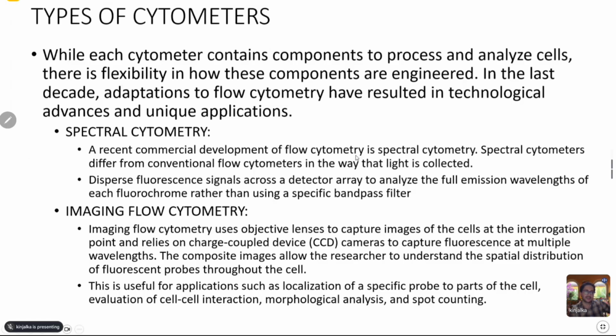It basically helps us reduce the spillages, because whenever these fluorophores are used and multiplexed, we are going to get a lot of spillage if there are too many antigens multiplexed. Spectral cytometry reduces those kinds of events and spillages, and you get more specific, sharper peaks which are not overlapping with each other in those histograms, right?